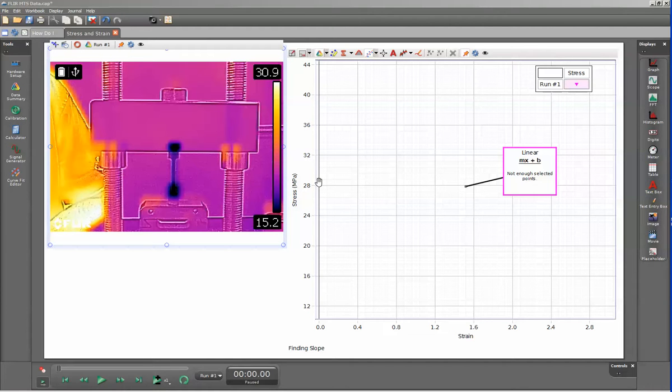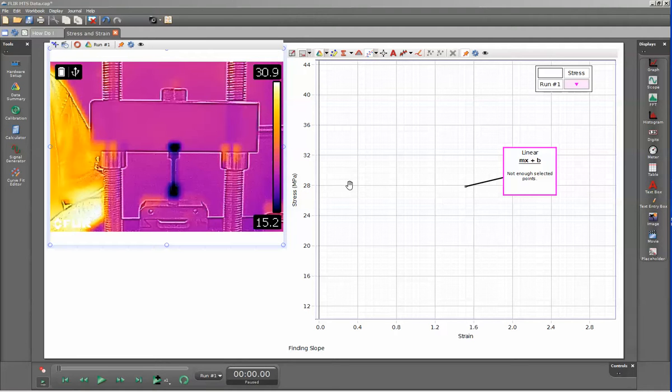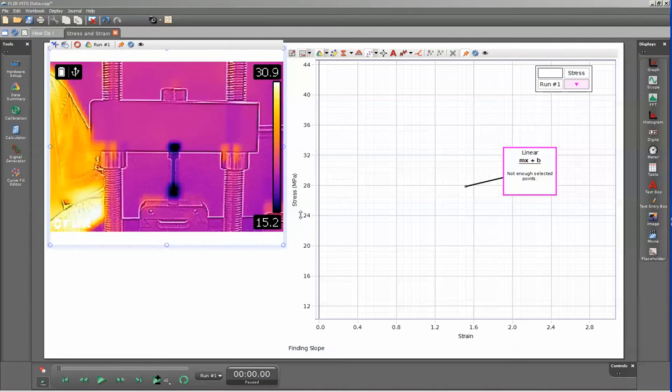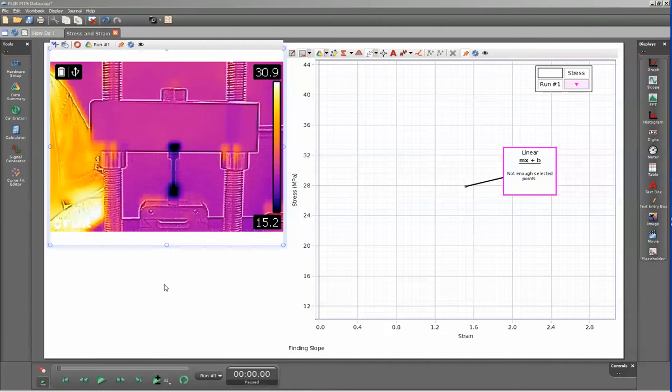I'm going to run this within the stress-strain workbook that I've established. While doing the materials test, it will track the force and displacement of the sensor. Using the calculations within the workbook, we can then transform those into the stress being placed on the sample versus the strain that the sample has experienced.